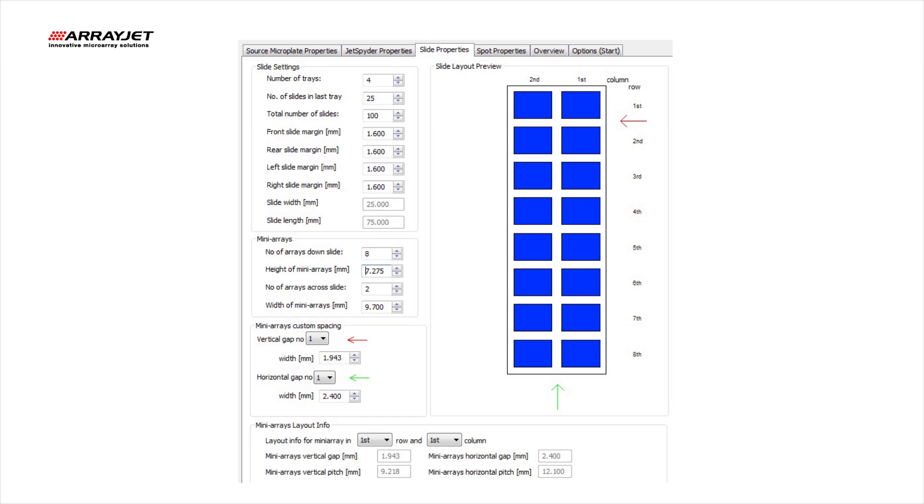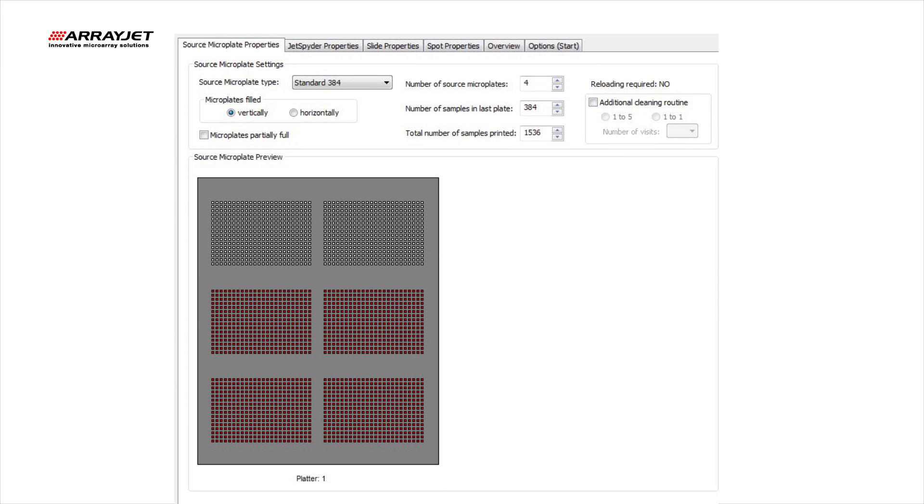Setup and testing of ArrayJet microarrayers is simple, intuitive, and user-friendly.